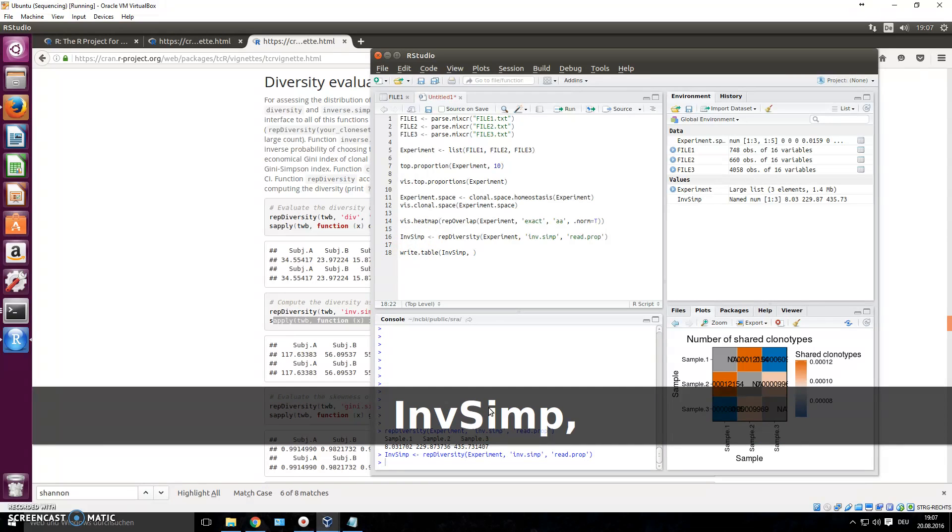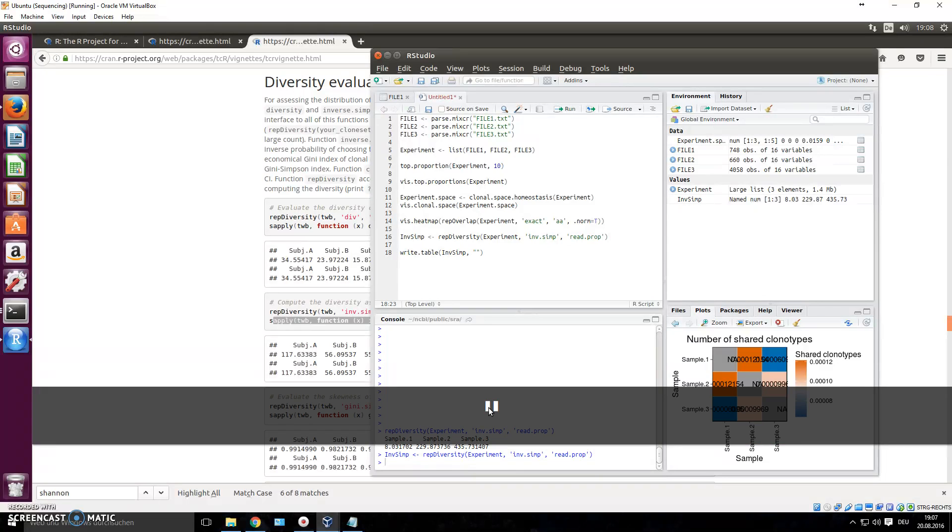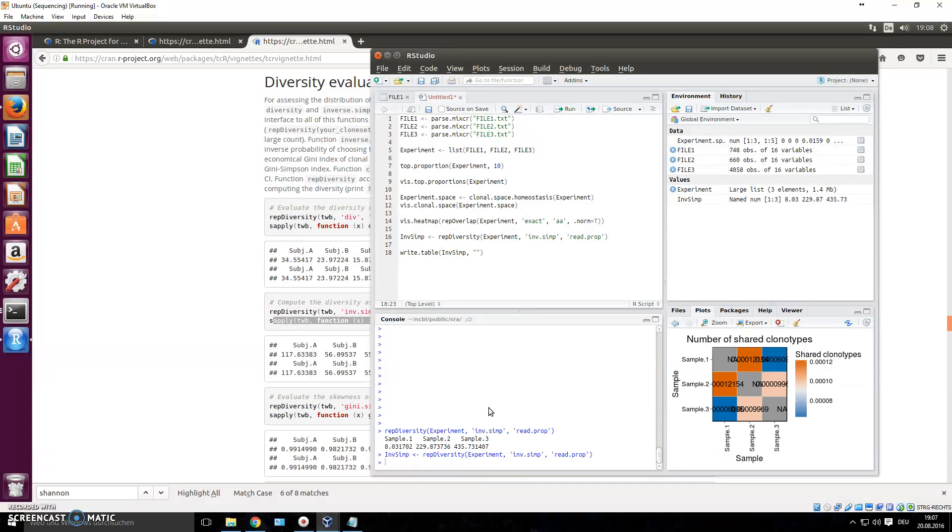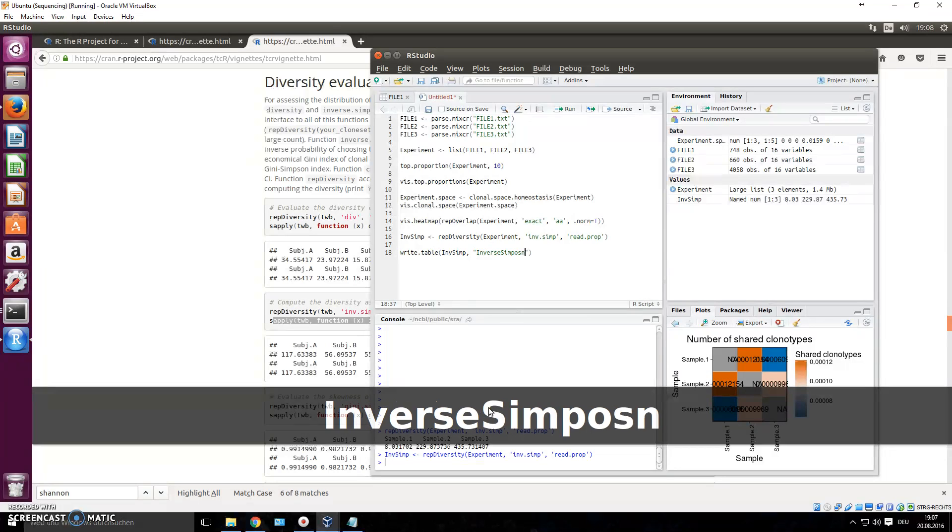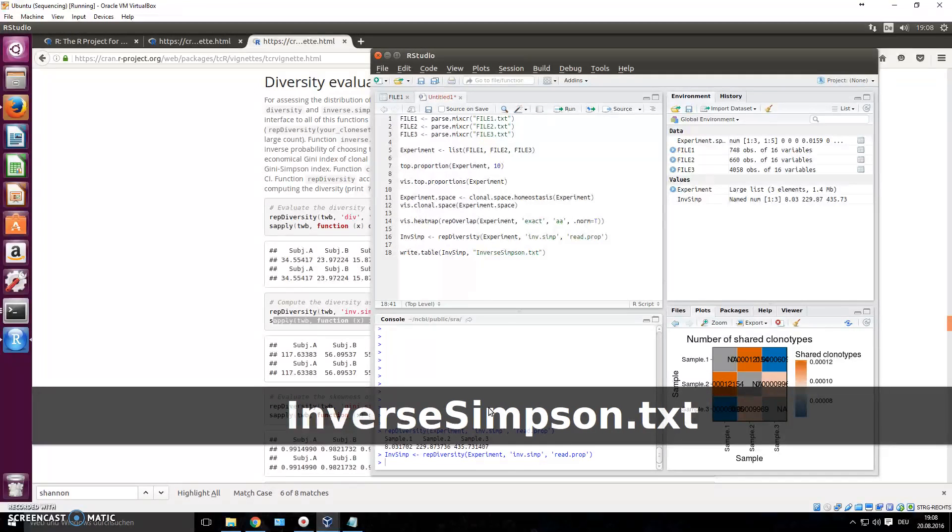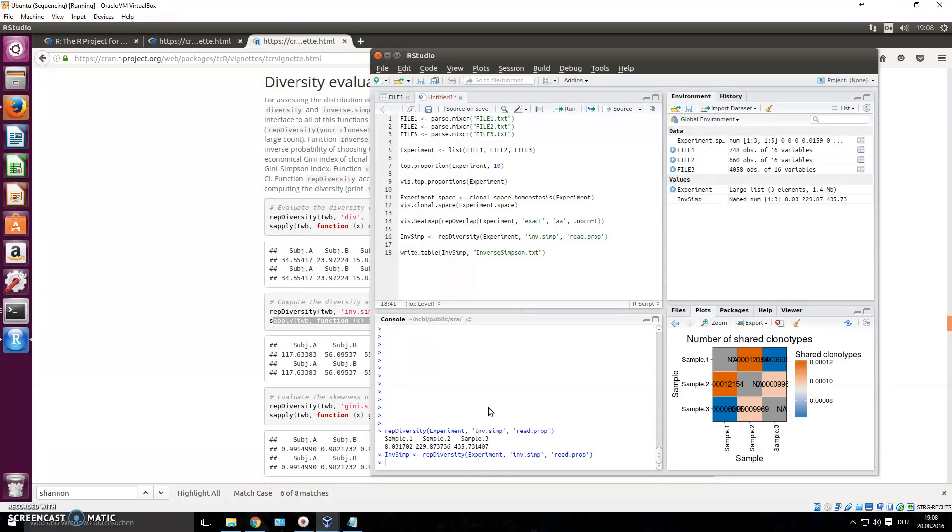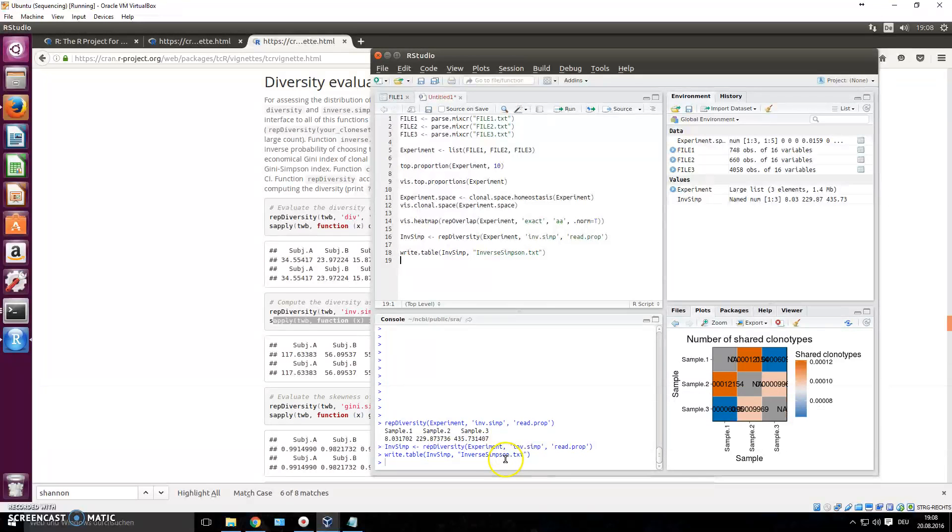Comma, now you can write down a name, the name of this file. So you can name this file, you have to do quotation marks, you can name it inverse Simpson, let's say we write a dot txt, just so you know better. If you write down CTRL enter now, it has saved this file.